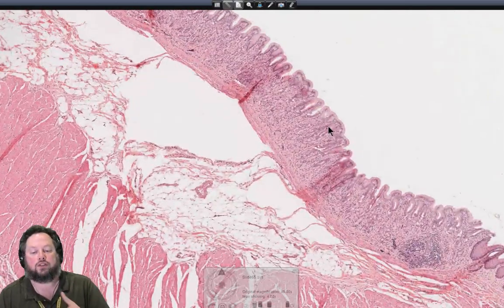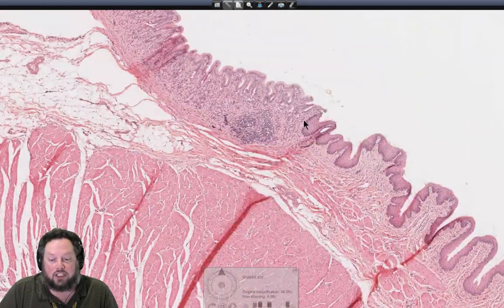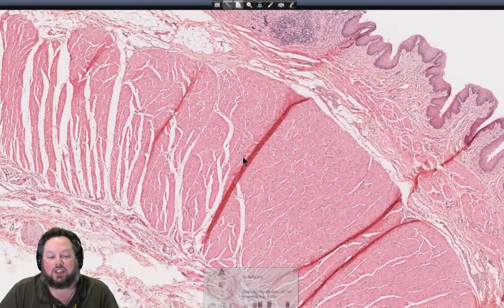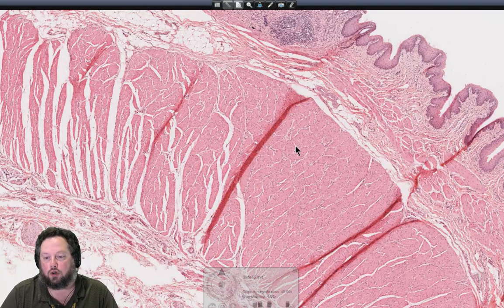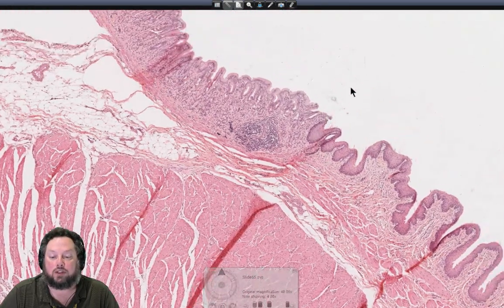And the pyloric region, of course, is the part that joins on to the duodenum. So quite a dramatic change in epithelium. So if you're looking for a junction, you're looking for a change in epithelium from this stratified squamous non-keratinized to a simple columnar. There's no true sort of muscular sphincter here, so there's no real thickening of the muscularis layer like we see in some of the other regions, like the pyloric sphincter, for example. There's a thickening of the inner circular layer of the muscularis, whereas we don't see that here in the lower esophageal sphincter, or with the junction with the cardiac region.